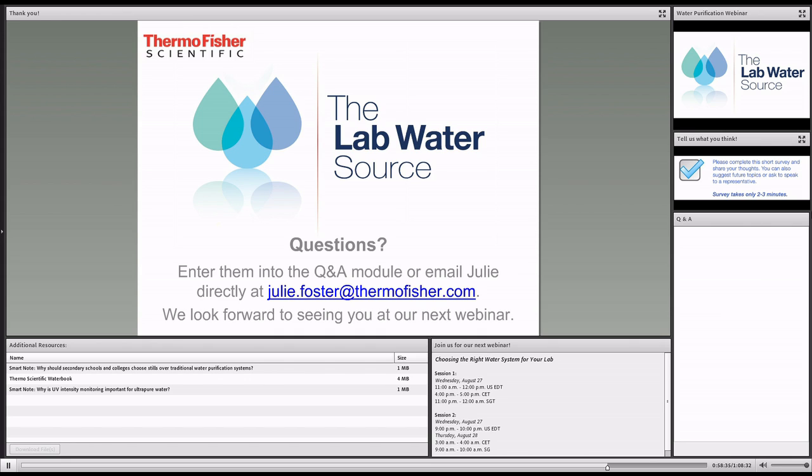But you would probably know right away if something was going on with your EDI cell, just based on the resistivity or conductivity, whichever you have the system set at. So if the system normally reads 15 megaohm and it can't get there, it's only getting to 5, a lot of times that's the issue. It's back to the EDI cell. So that's not something I would ever try to troubleshoot on my own. That's a good call for the tech support of your manufacturer. They'll help you troubleshoot that.